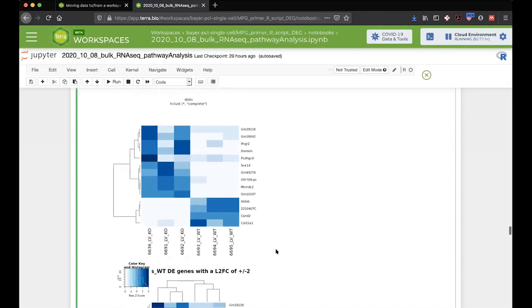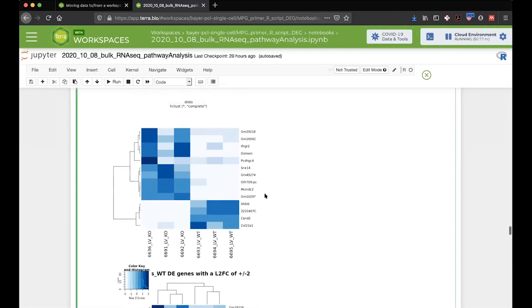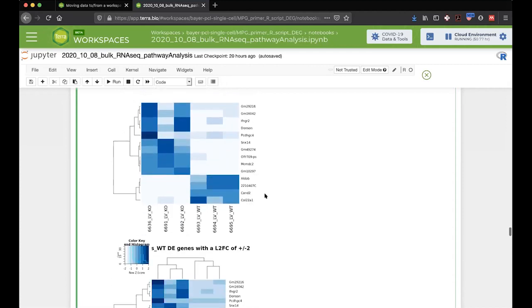And then when we look at the initial heat map plotting, we don't retain this dendrogram, whereas with heatmap.2 we can add it in. But here's all of our lists of genes that are downregulated, basically upregulated in knockout, and the genes that are upregulated in wild type in comparison. There are not a lot of genes here, which makes the GO term analysis kind of interesting. But yeah, I think it's a really nice representation of what's actually changing in your heat map. This was a particularly isolated list.